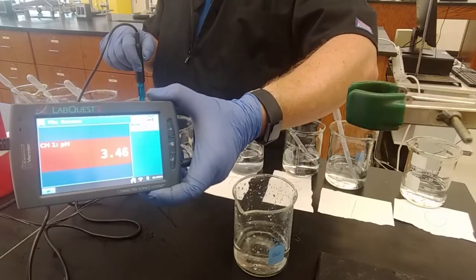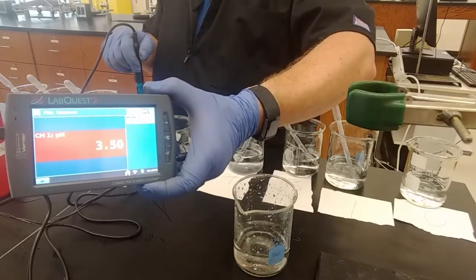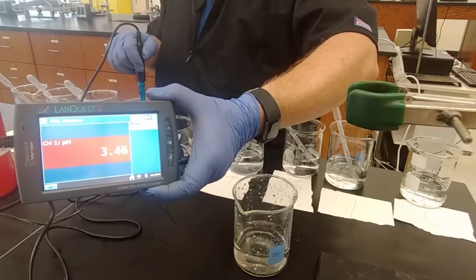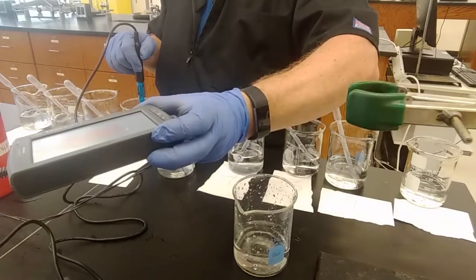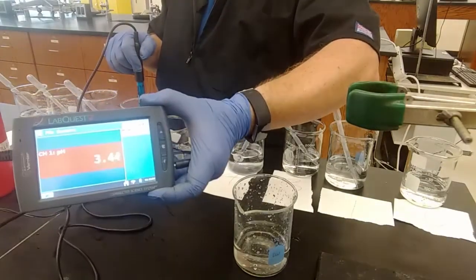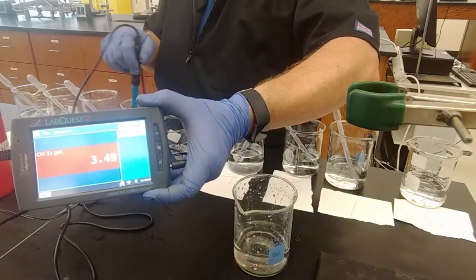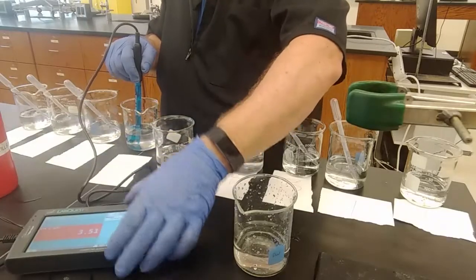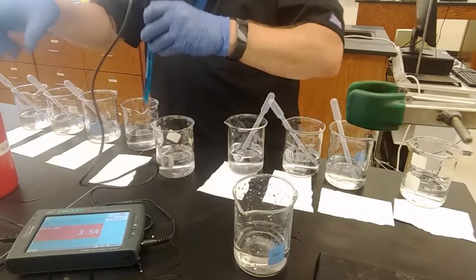Okay? Our deionized water that we used to dilute our base was incredibly acidic based on our test. And so instead of pH 10, we have a pH of 3.48. We will confirm it with some other pH measuring instruments. But there we go.